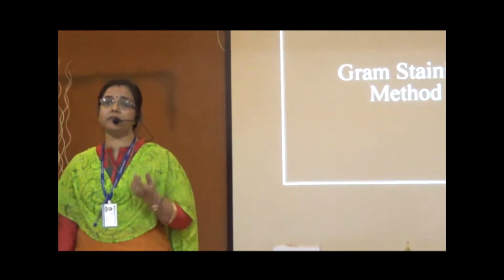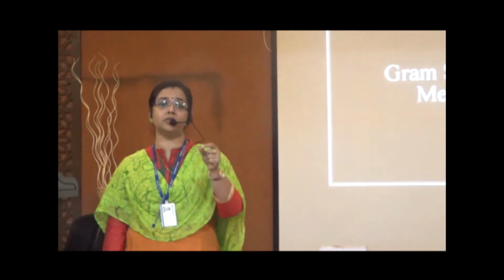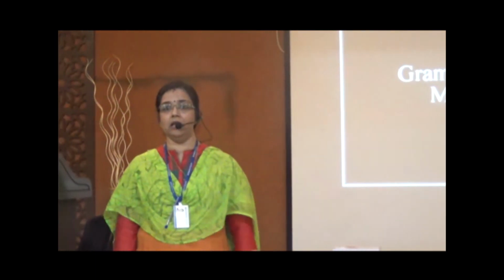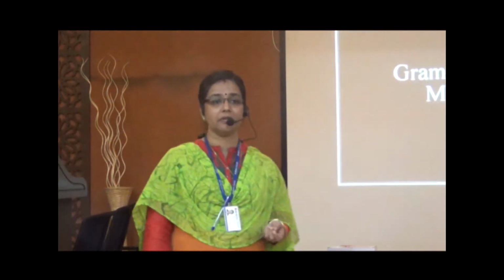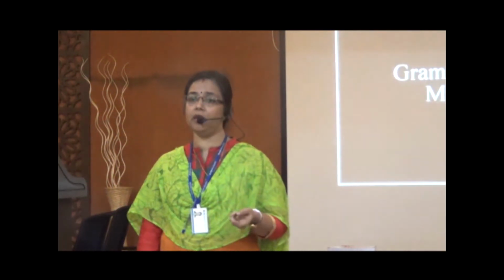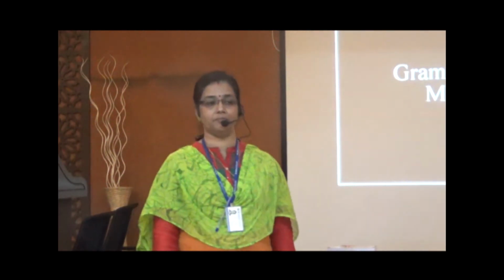For this, the first stage is the identification of the type of pathogen participating in the field. Today we deal with the topic gram staining. It's a process that is used for the identification of the type of bacteria involved in the process.